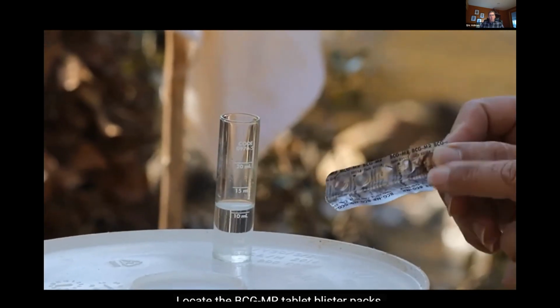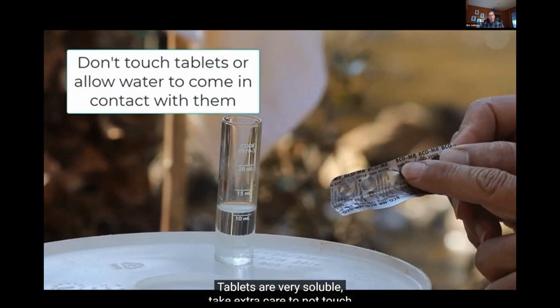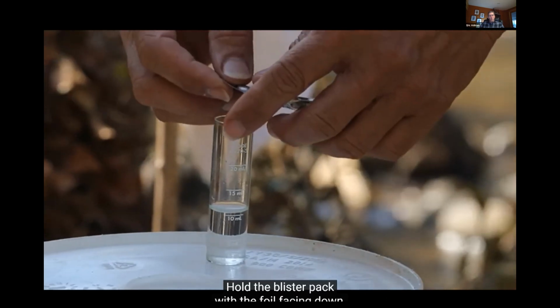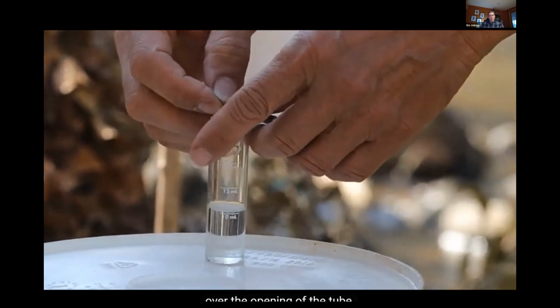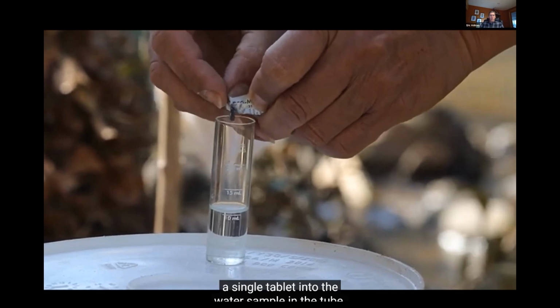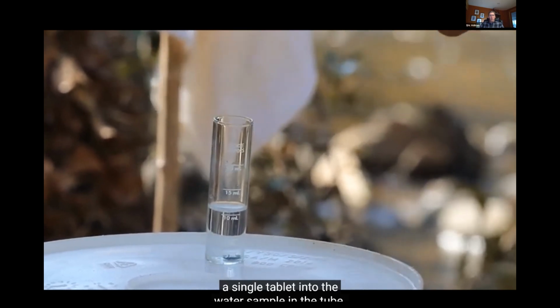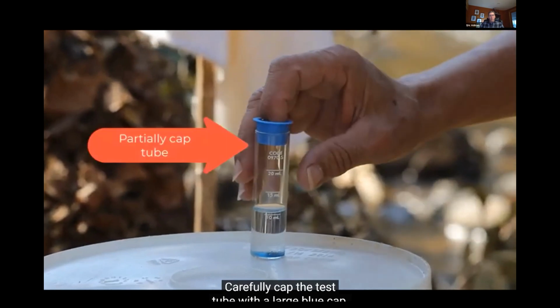Locate the BCG MR tablet blister packs. Tablets are very soluble. Take extra care to not touch the tablet or allow any water to touch the tablet prior to dispensing it in the alkalinity tube. Hold the blister pack with the foil facing down over the opening of the tube. Press on the opposite side of the blister pack to dispense a single tablet into the water sample in the tube. Carefully cap the test tube with a large blue cap.